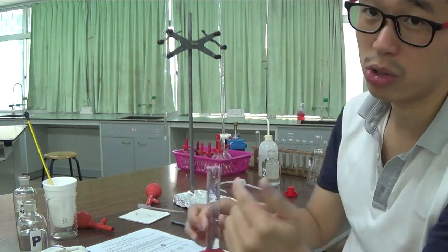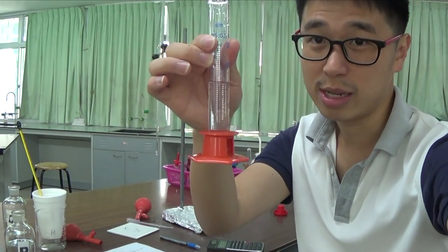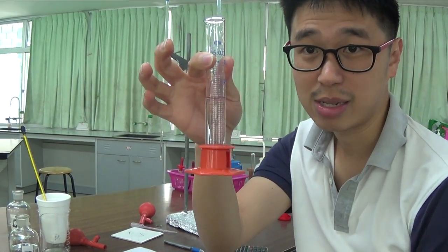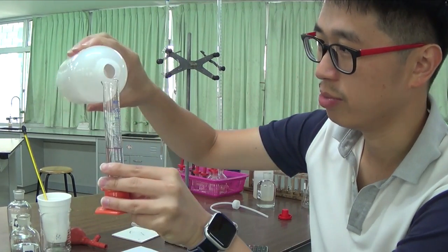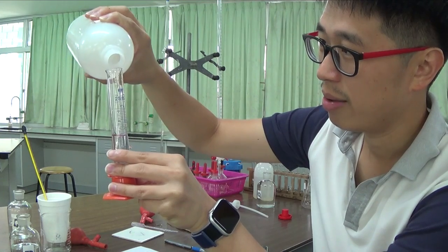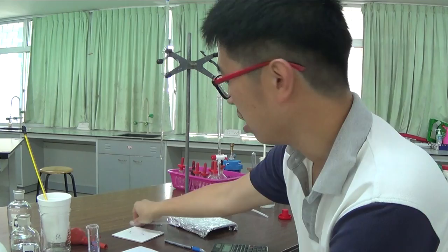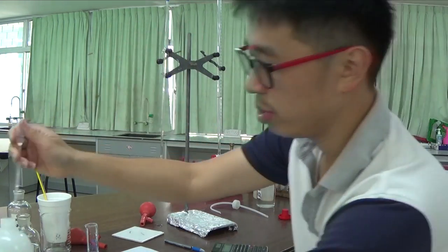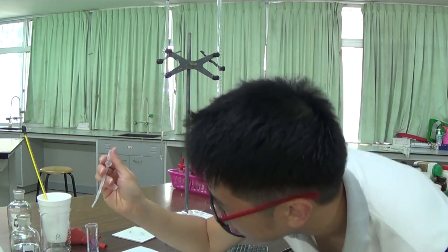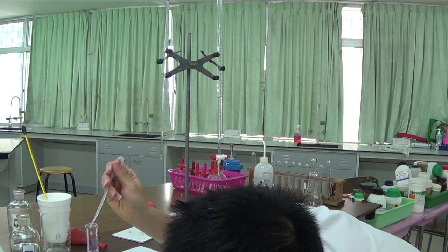Well, I know it's 16.0 not from the measuring cylinder, but from the burette, because measuring cylinder is not accurate to one decimal place. Okay? So what I do now is I need to add water, distilled water. Make sure you don't overshoot it, don't be greedy towards the end. Okay, use a dropping pipette, take out the water, do it on the ground on the bench, and read below the meniscus.